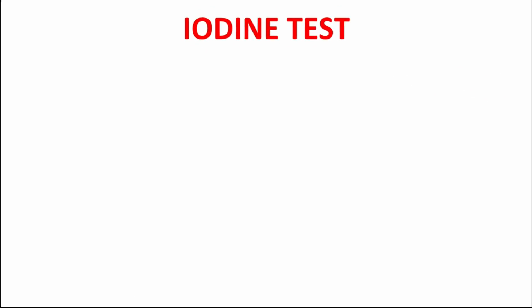Okay, let's talk about the iodine test. Basically, this test is specific for polysaccharides like starch, dextrin and glycogen. This is not a chemical test. Basically, it depends on the physical property, that is adsorption.